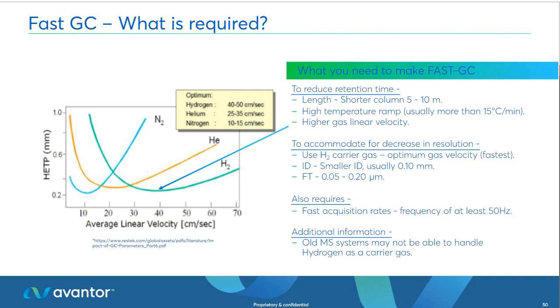Additional information, old MS systems may not be able to handle hydrogen as a carrier gas, so it's good to just double check this.